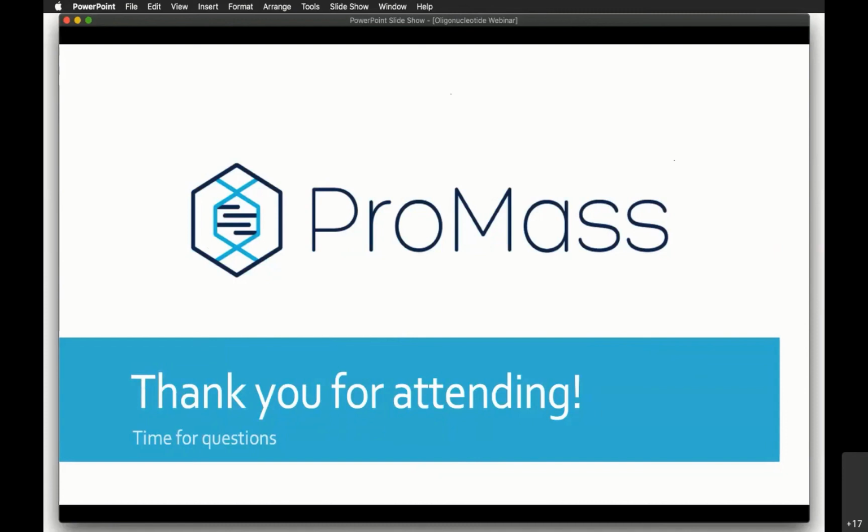Anybody else have any questions right now? Okay, one more since no one else is jumping in. Thanks, John. Where do I type in the sequence? Because typically I just give you masses, I don't actually give you the sequences involved. Sure. But can I basically include that or type in that sequence once I have a generated report?